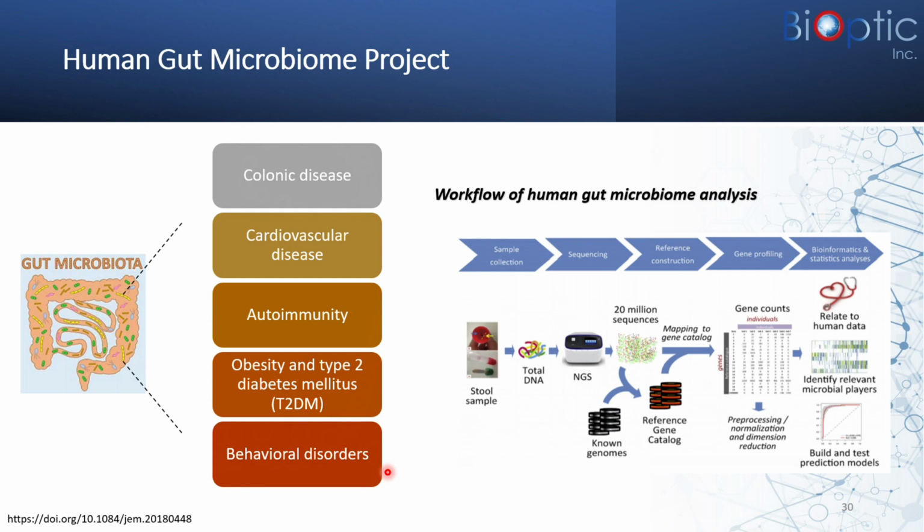This is an example workflow for gut microbiome analysis. Scientists extract the total DNA from human stools for next-generation sequencing and then identify the bacteria species by bioinformatic analysis.